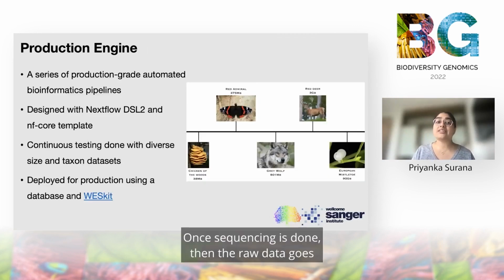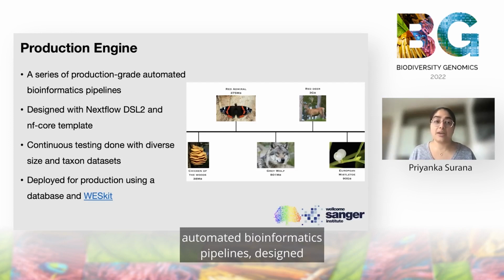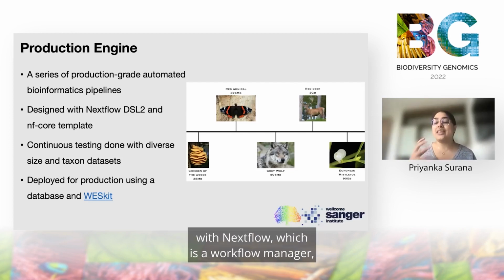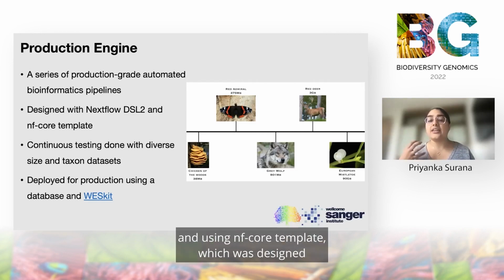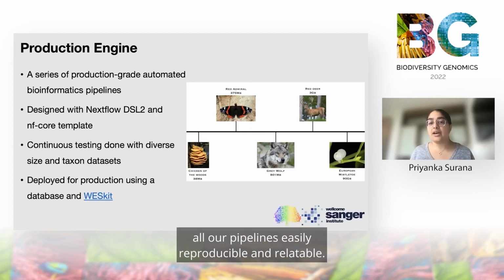Once sequencing is done, then the raw data goes through a series of production-grade automated bioinformatics pipelines designed with Nextflow, which is a workflow manager, and using nf-core templates, which were designed by a community initiative, which makes all our pipelines easily reproducible and relatable.